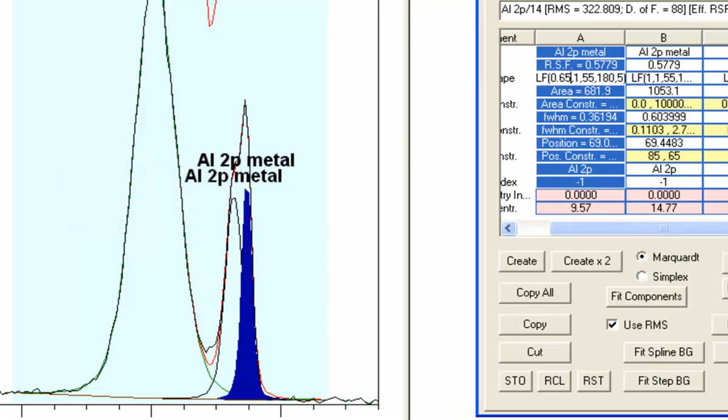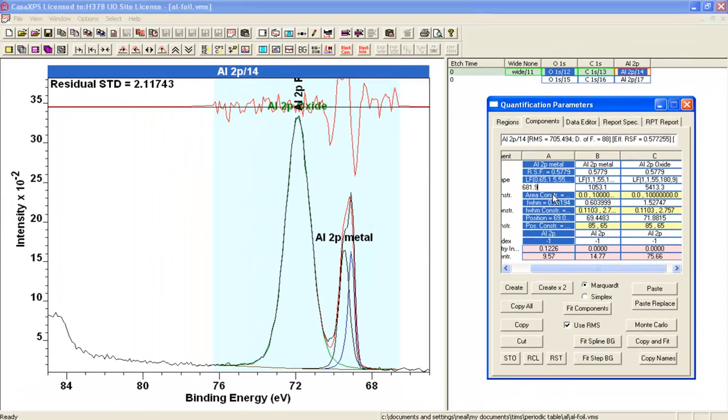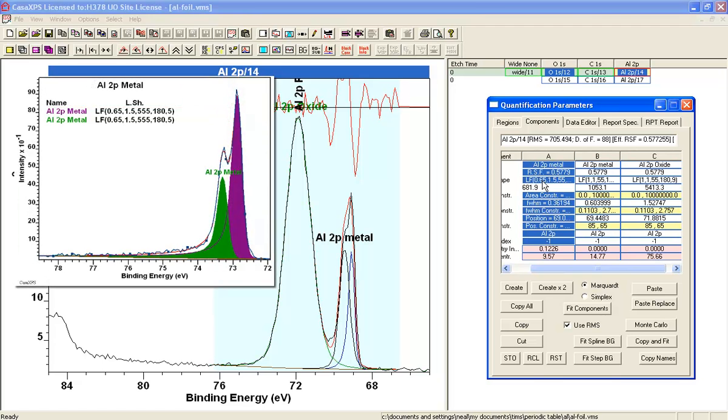And so I'm going to set the first parameter to be less than 1, and I'm going to set the second parameter to be greater than 1, and that has the effect of extending the line shape on the left and suppressing it on the right. In other words, asymmetry.